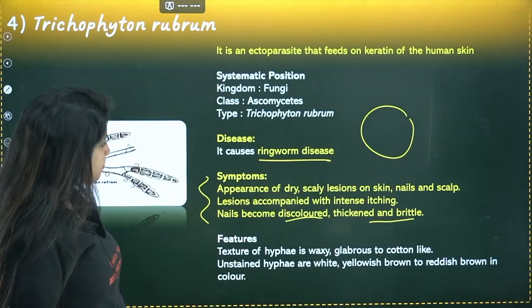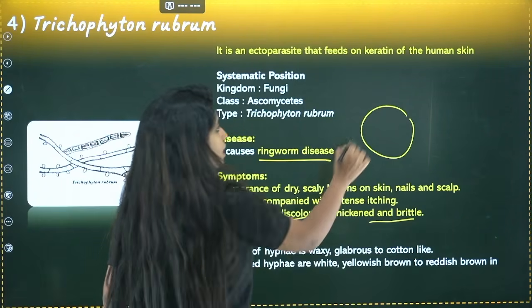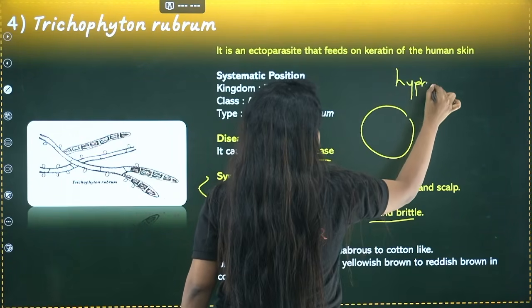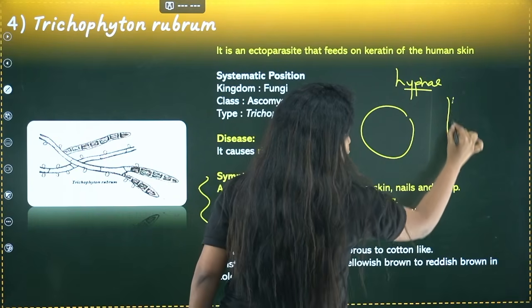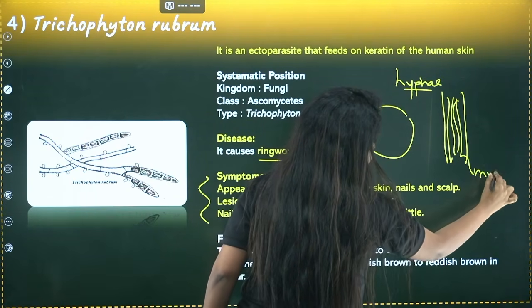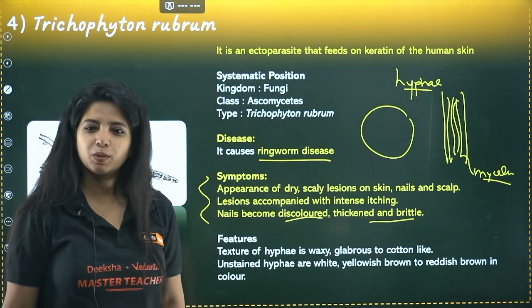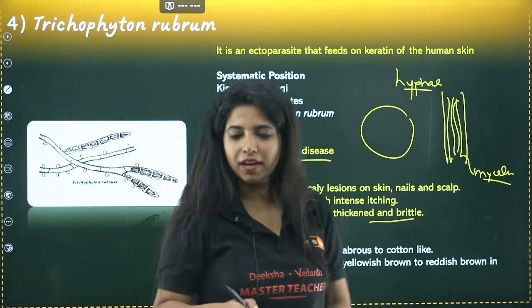And if at all you talk about fungi, fungi are made up of small things that are known as hyphae. The hyphae come together and form mycelium. Ma'am, is it too much information for us now? Yes. So which is why I'm not discussing it too much, but please know that all these things that you are seeing over here are made up of multiple hyphae.